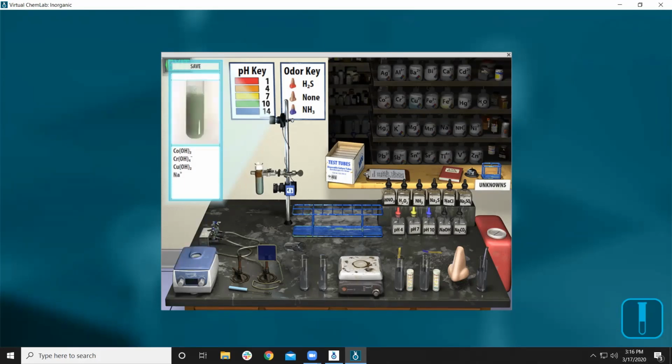What if I go to sodium hydroxide? Well, now I have chromium, which is amphoteric, in solution, but I've got the cobalt and copper. So now it's centrifuged, and I can do a decant and separate that product. Now here's my chromium. I could switch them, oops, missed. I could switch it and do some chemistry on the chromium by itself if I wanted to.